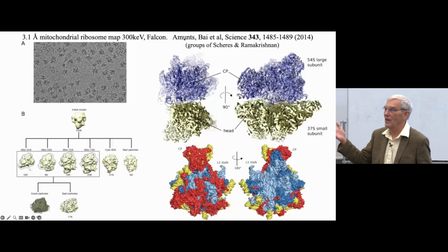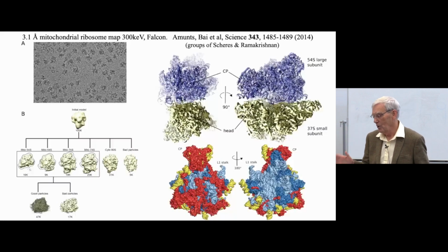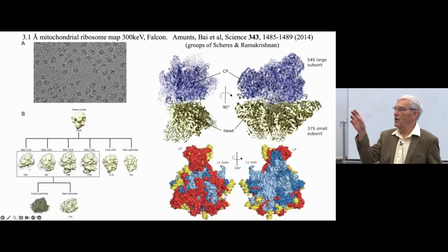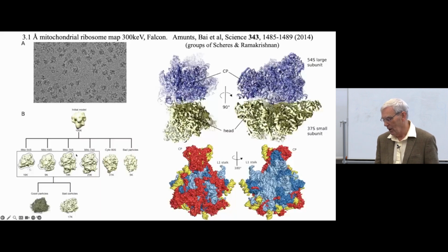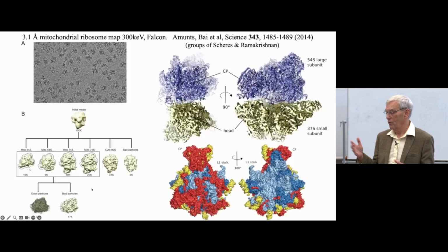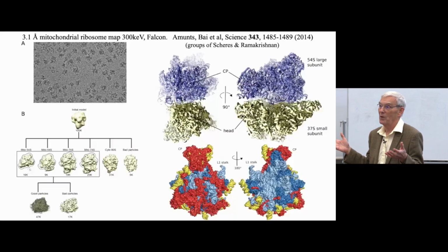They always had 20 or 30% impurities, cytoplasmic ribosomes, but using software that Georges Cherez had developed probably about 10 years ago now, and working with Xiaochen Bai, who was an electron microscopy expert, they got first a blurry structure, and then using methods of classifying to separate out which ribosomes were the ones they wanted, mitochondrial ribosomes, which ones were cytoplasmic. They got images like that, and then with other types of refinement where you can disentangle different structural states, eventually they get a high-resolution model of the whole ribosome, both the large subunit and small subunit, from one set of images that takes them a day or so to collect.